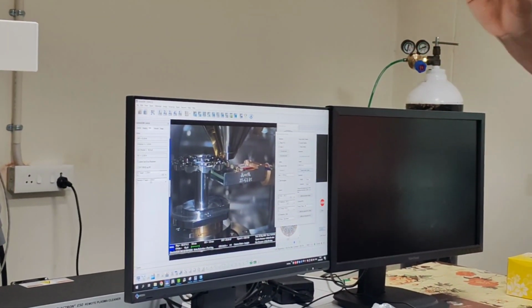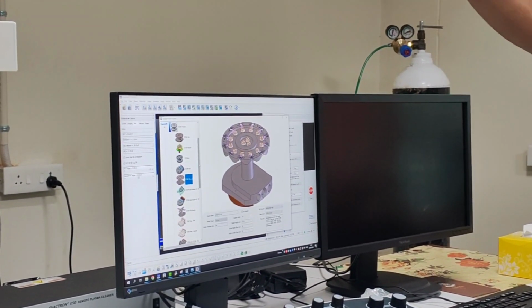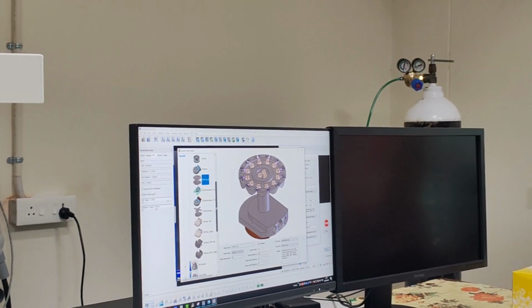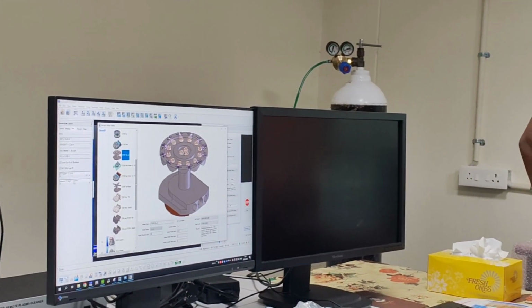All the other detectors, I think you know, the SE, BSE, Lens SE, Lens BSE, what exactly the difference between those image contrasts and all those things is, I hope you already covered during the last slide. Any questions?